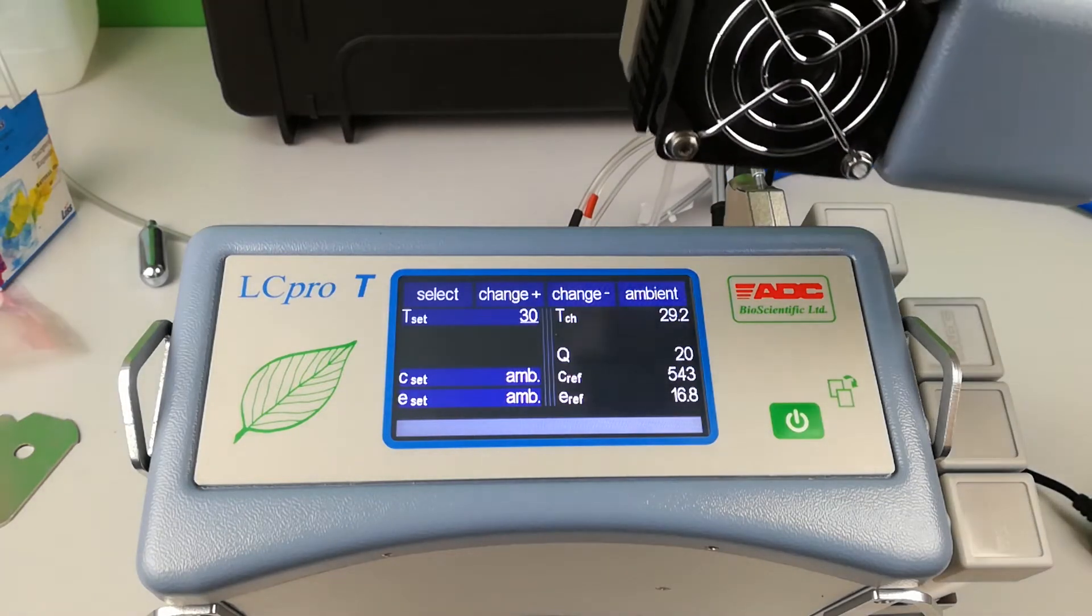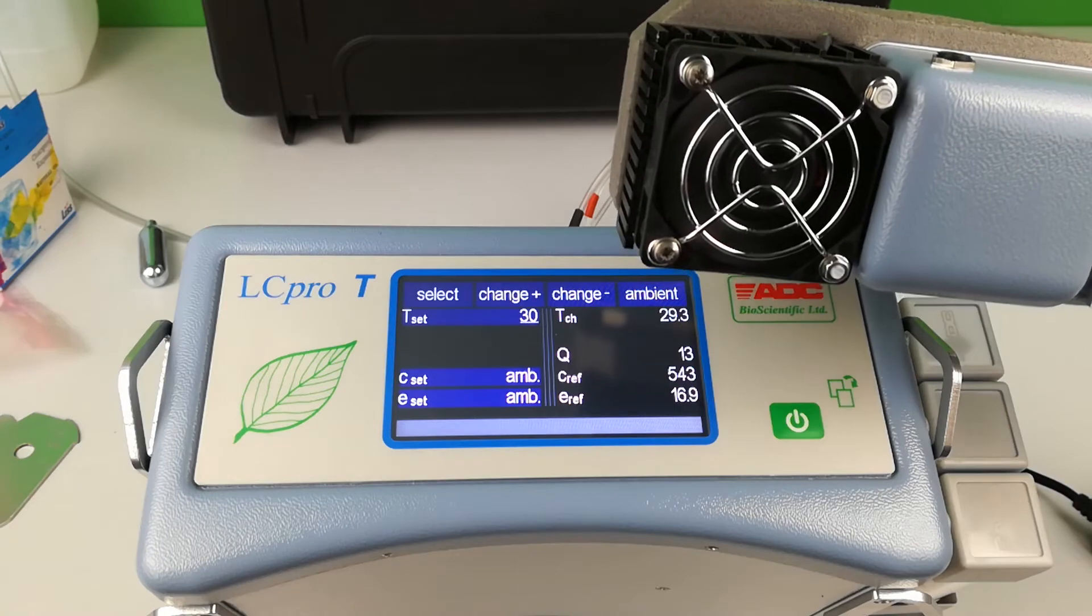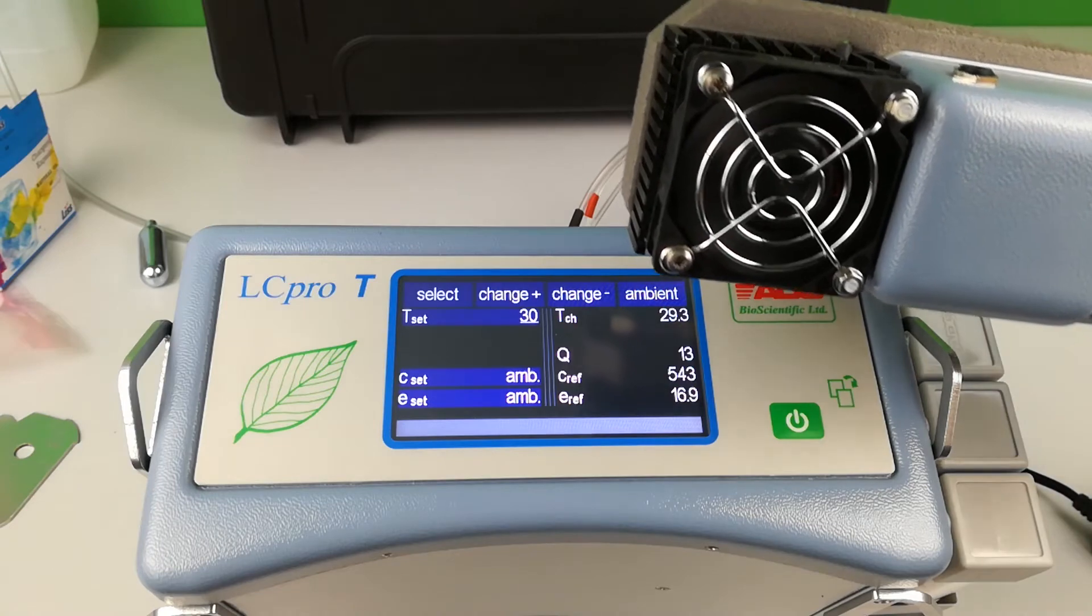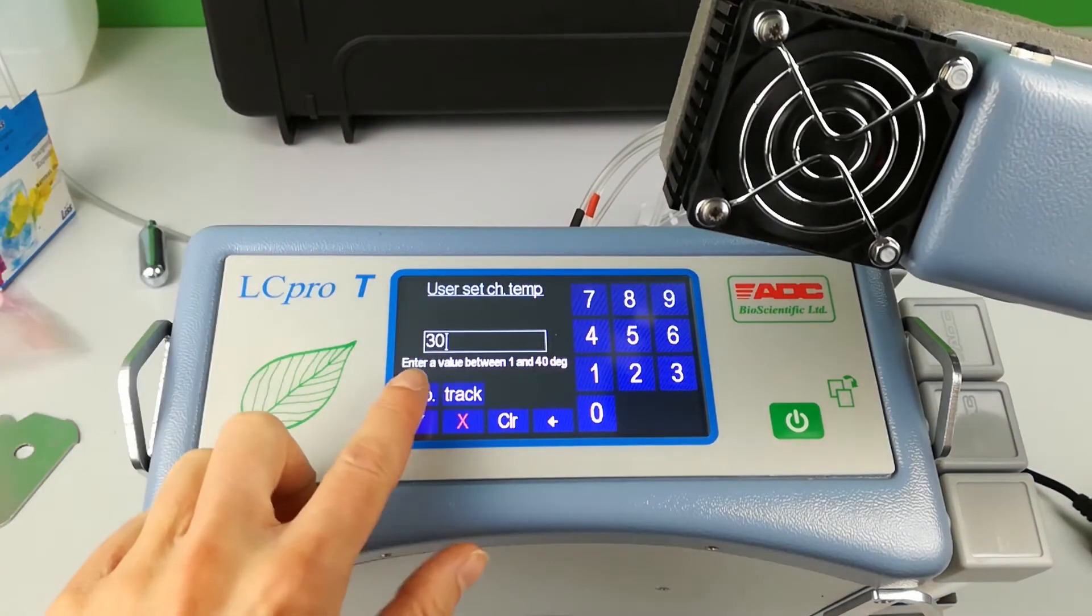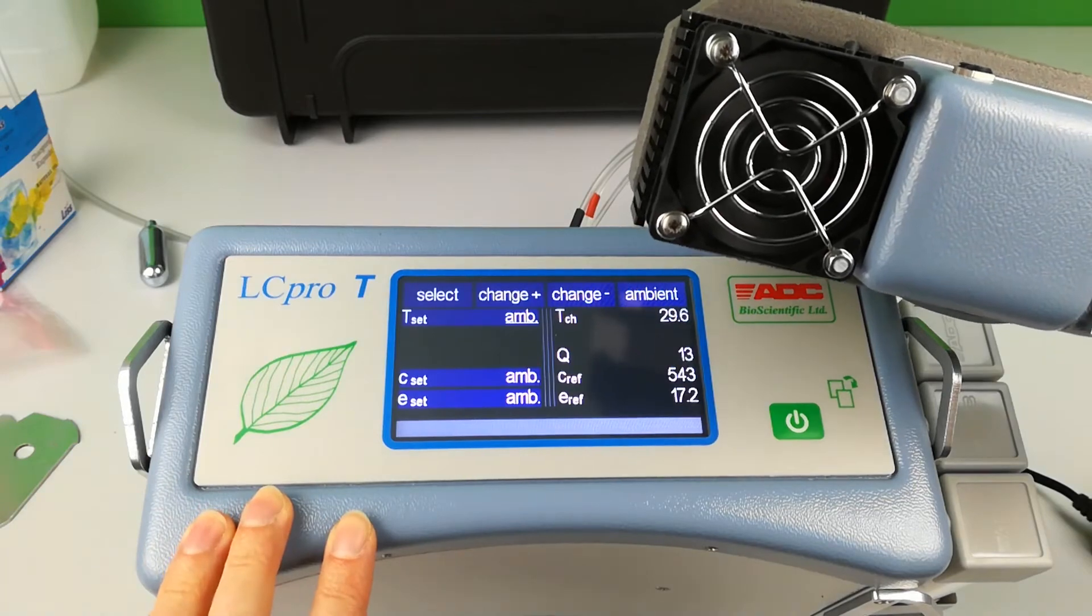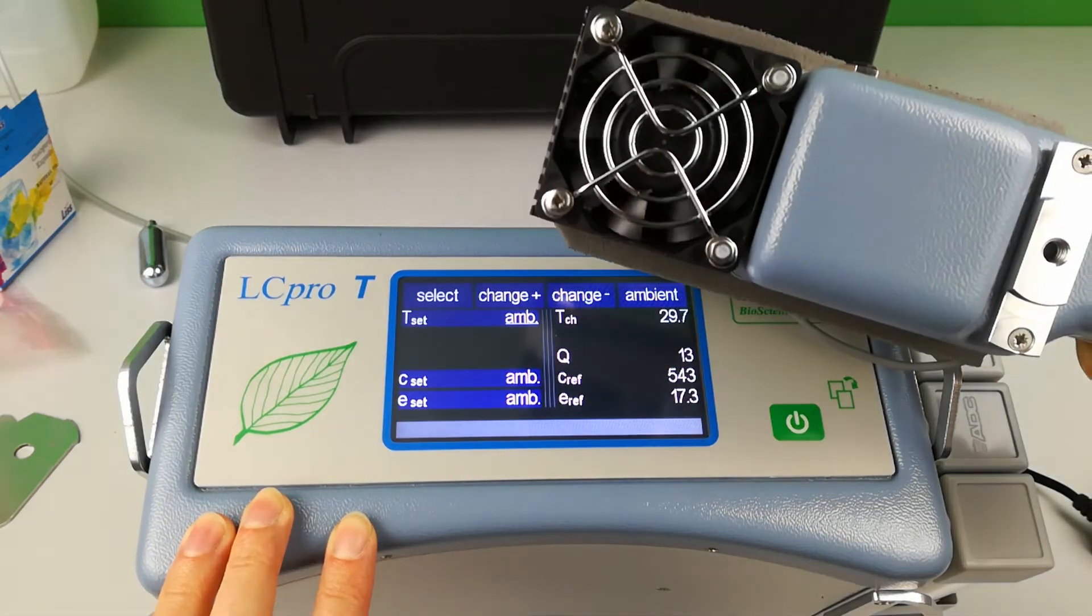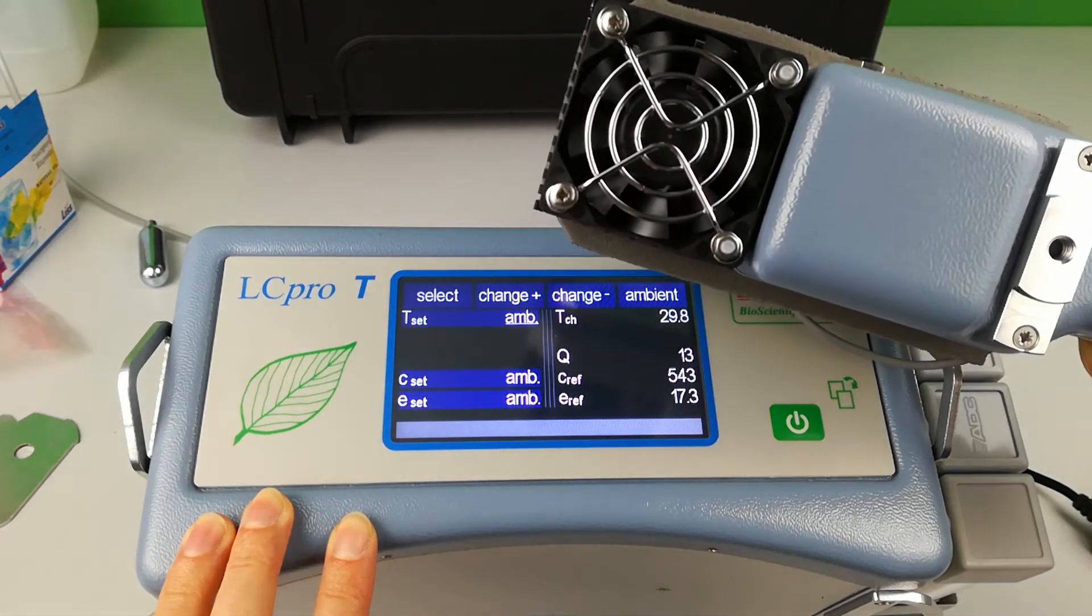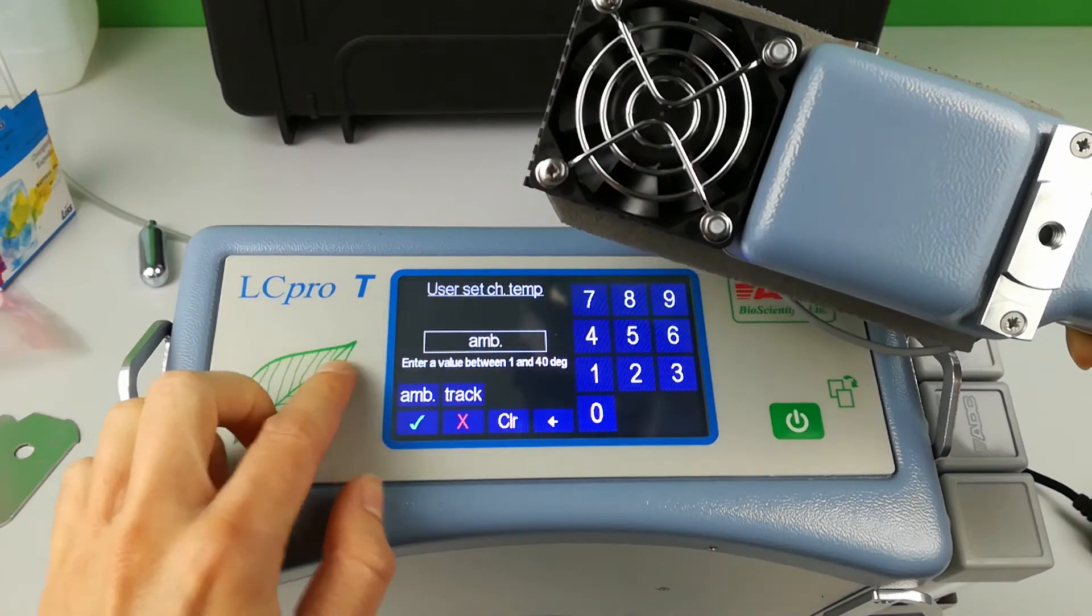The Peltier heat exchanger at the base of the chamber will achieve this set temperature value. Here you can see the fan begins to turn when you change temperature from ambient to a set value.